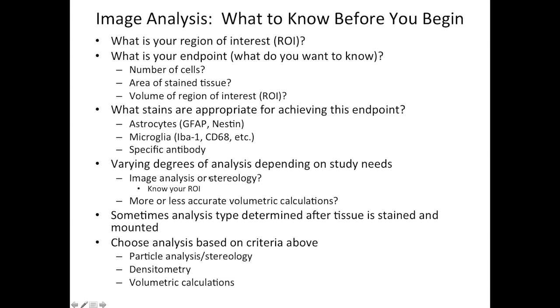Image analysis isn't really going to do the trick for that, because the cell population is so dense in that area. You need something along the lines of stereology to get good numbers for that. And again, whenever you're considering this, you need to know what your region of interest is.